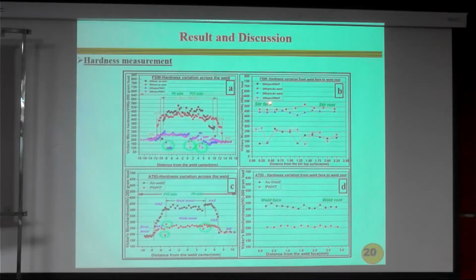So, in the as-welded one, a steady hardness profile is reached, which also means that a uniform temperature across the weldment is noticed. After doing the post-weld heat treatment, as I explained, wherever the soft zone and hard zone were there, you can see the sudden abrupt, uphill and downhill profile of hardness.